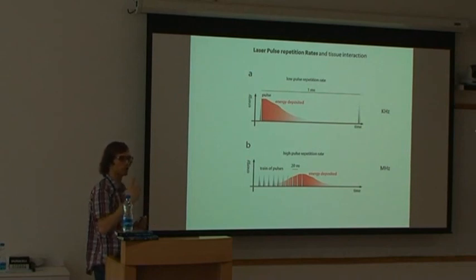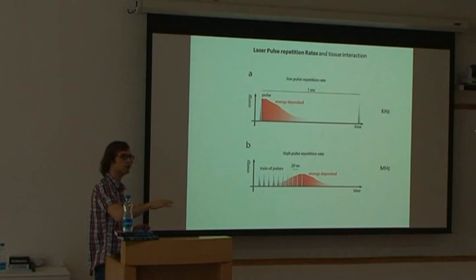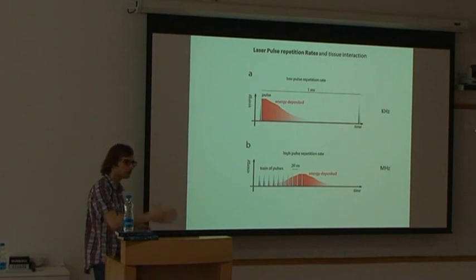So there's not one type. It will always depend on the table that I will show you below. You will look at the parameters, and given these parameters, you will know this type of ablation will be of this type. And you will know also that each type of ablation will have more or less collateral effects, and which collateral effects. This is the kind of information you have to be critical about, and say, okay, this paper is using this tool, does it need to do this control or not?